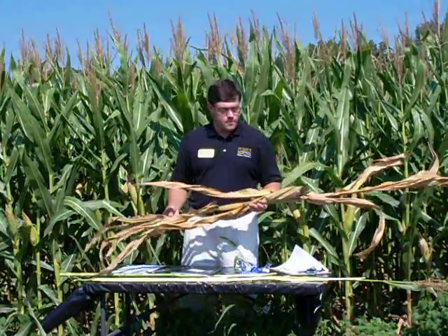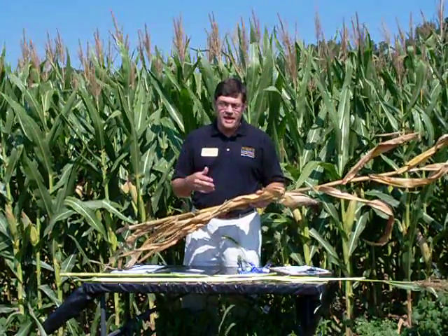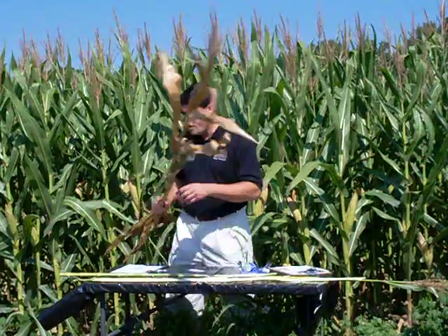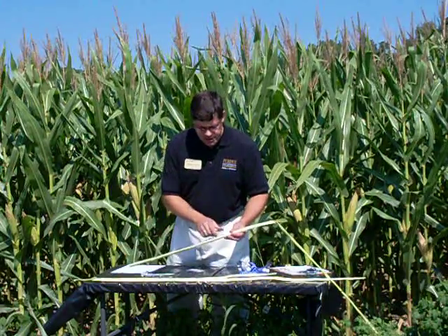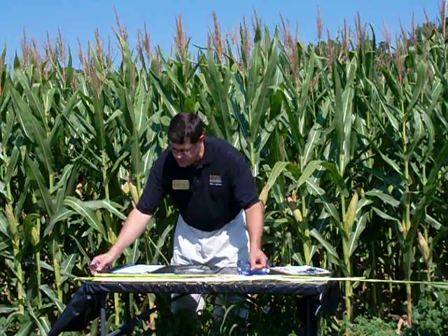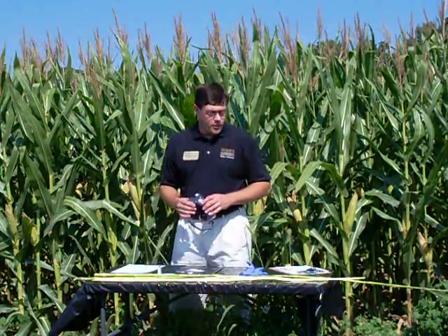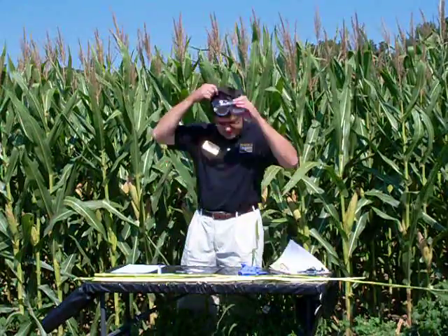What we're going to start off doing is, first of all, go through and collect samples again from areas of concern and more normal areas in the field. We'll come back and strip off all the leaves from the crop, so all we have left is the stalk itself. Once we're done doing that, we're going to take a knife and strip the stalk so we have only the pith showing in one half of the stalk itself. At that point, we're going to start using sulfuric acid, which is a major concern as far as getting it on your skin, clothing, or other parts of this experiment. So we're going to be using goggles and gloves to make sure nothing happens to me while I do this.